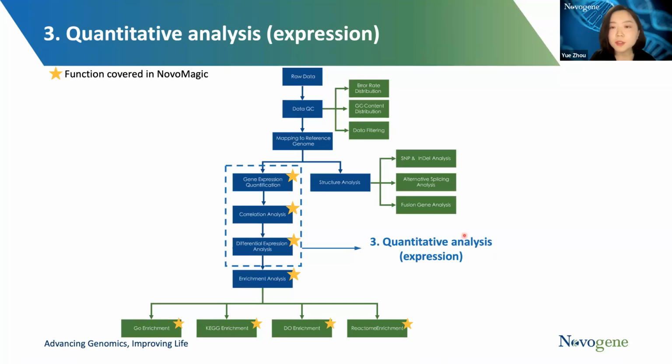So after the completion of mapping, the analysis moves forward to the expression analysis, also called quantitative analysis. From this part, it is already available on NovoMagic. So all of these functions, you can find on NovoMagic.